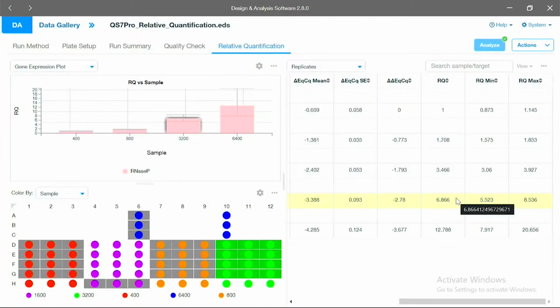Personal preference, I had a lot of room on the plate, and just to avoid any cross-contamination issues, I did. If I'd had more samples, I would not have done that. Sometimes if you have, say, an 8-column multi-channel pipette, you'll go every other one just because that's how it fits into a 384-well plate. So no good reason.